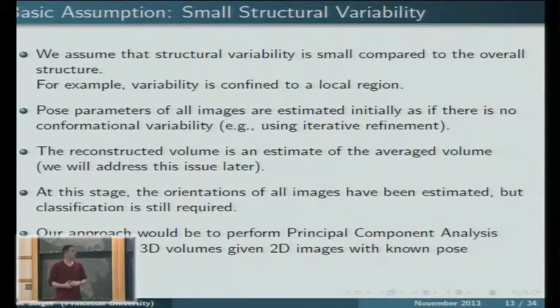So to make progress with this problem, we'll make some assumptions. The first assumption is that the variability is small. That means the molecules don't change. Right, they change, but they change a little bit.